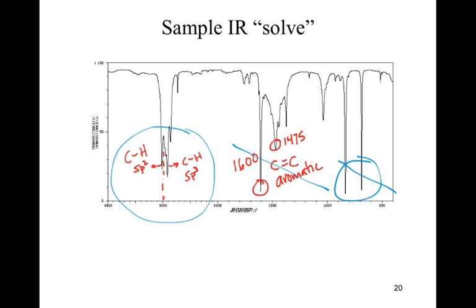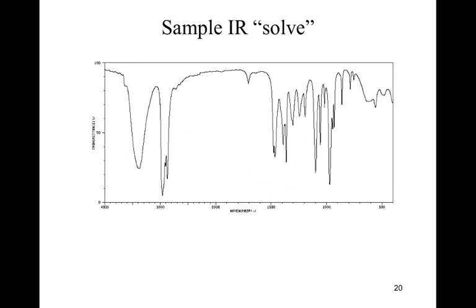Okay, so next spectrum, and I will go ahead and pause. 1, 2, 3. Again, quick evaluation. I see a big broad signal looking at an OH. Drop my 3000 line. These peaks are all to the lower end of that. I'm looking at a CH sp3. I look further to the right. The next big signal I see was at 1475 at best. That is definitely under my 1600 range. I'd leave it alone. I wouldn't analyze it until I had some more information about the structure.